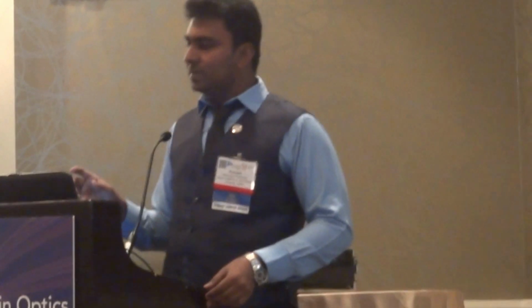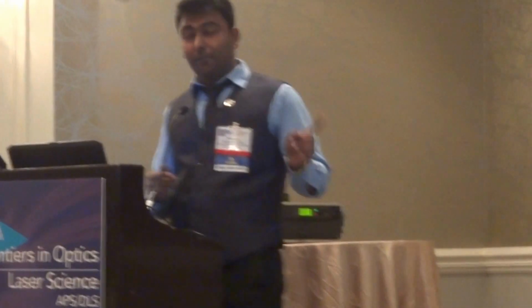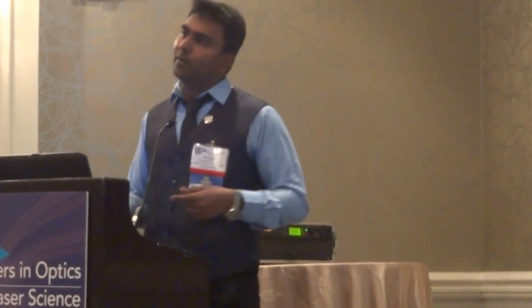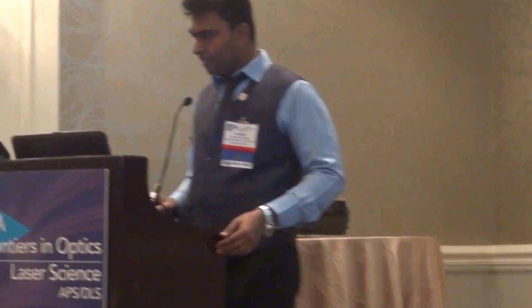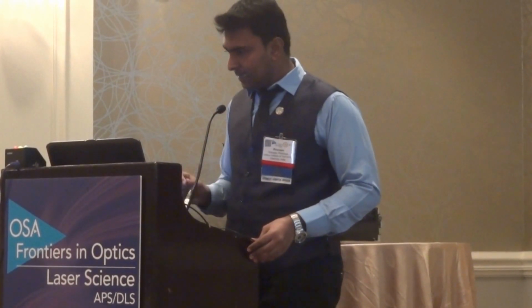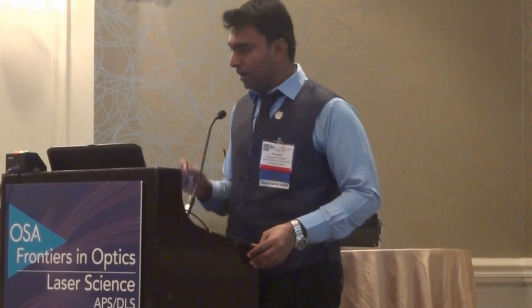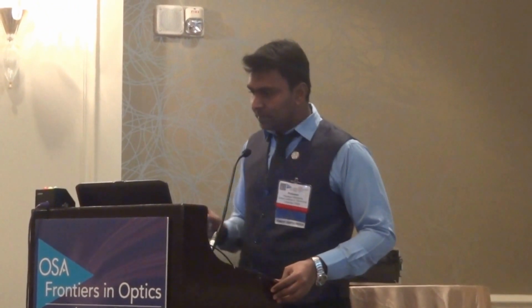And most of the specimens, microscopy specimens, are sparse in nature. When you use a direct method for reconstruction, actually you lose the phase. This is compressive sensing. I quote, "Many natural signals are sparse or compressible in the sense that they have concise representation when expressed in the proper basis." End quote.